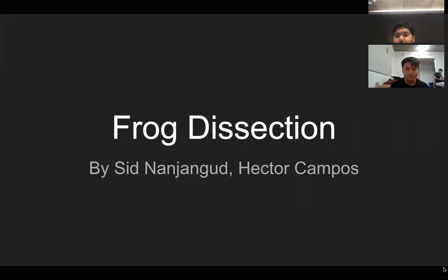All right, hello, my name is Siddharth. My name is Hector. And today we'll be presenting our frog dissection in comparison to a rat dissection.